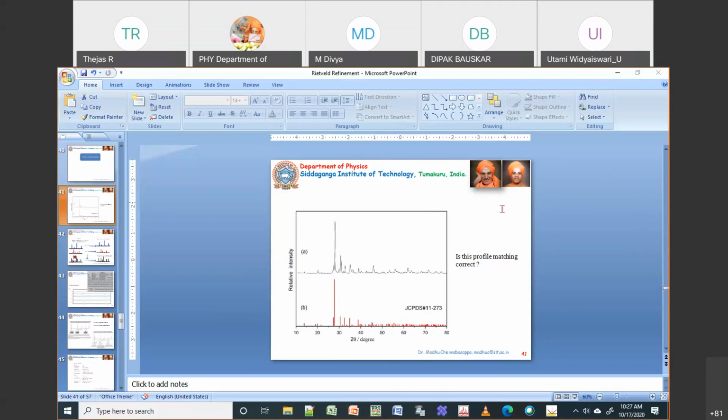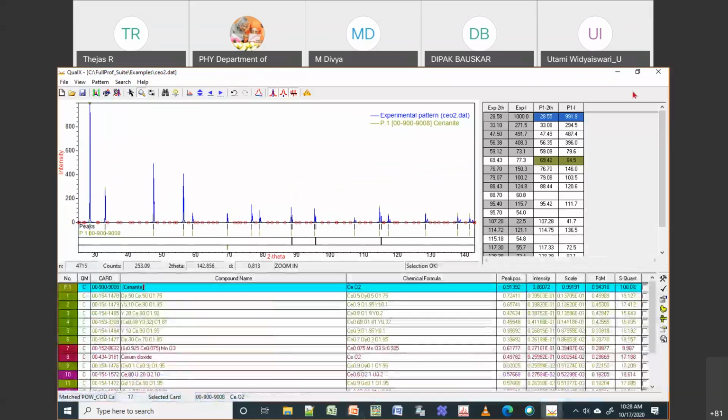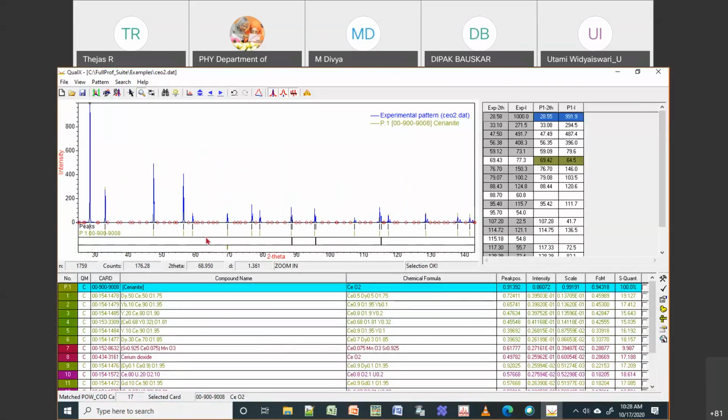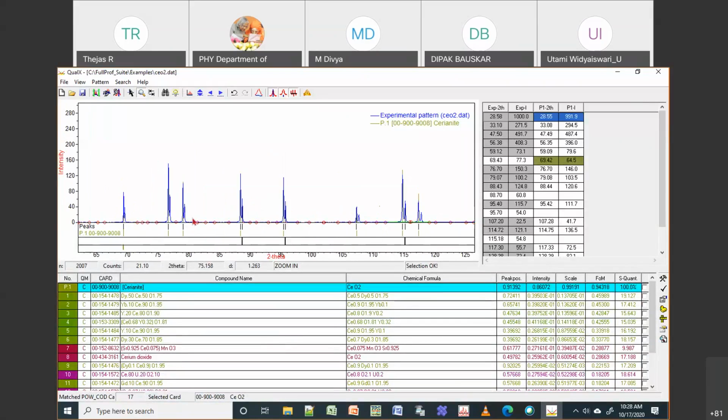Next question: when you zoom in on the XRD data around 70 degrees, it has two peaks, however the table has one peak. Okay, fine. This second peak, as I explained yesterday also, occurs at higher angles. If you take anything above 60 degrees, you can see that each peak splits into two peaks.